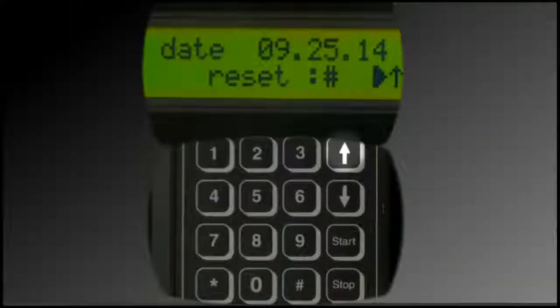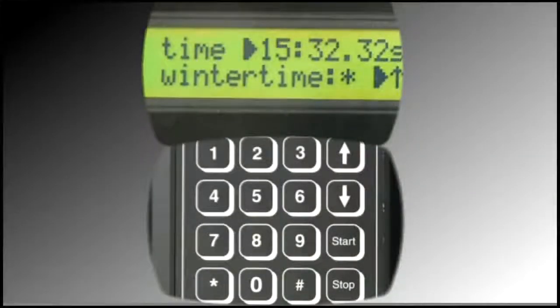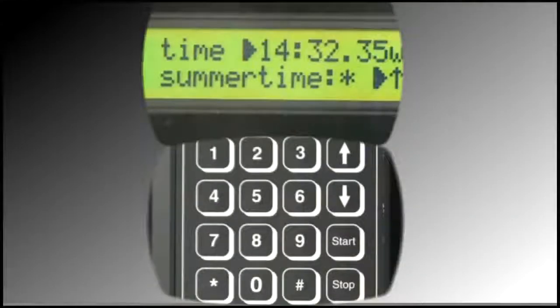Press the up arrow. The time displays in the format hour, minute, seconds. Enter numbers if desired to change the displayed time. Again, numbers move from right to left. If desired, pressing the star icon will toggle the time by one hour — it represents a simple way to adjust for daylight savings time.